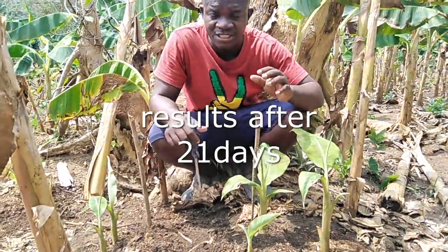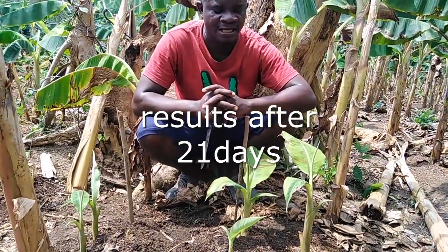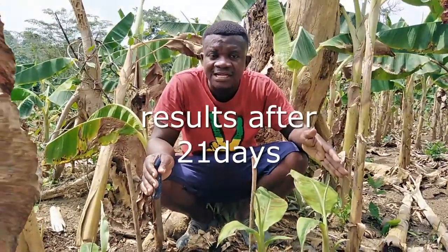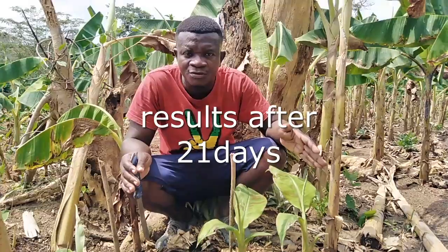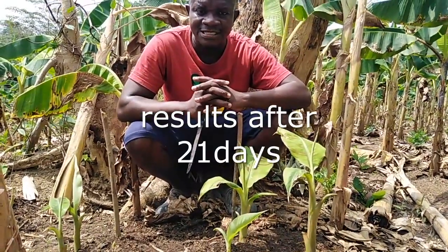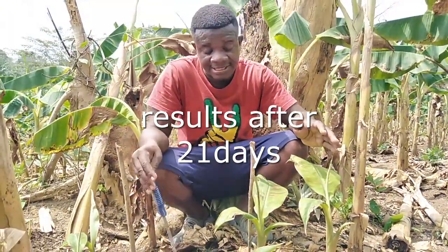We are at 21 days — exactly 21 days old, which is three weeks — and this is the result we are getting. Initially, literature said coconut water contains cytokinins and gibberellins, and these growth hormones are said to induce cell division which can easily result in a high number of seedlings. But upon conducting that research, this is the result we are getting.